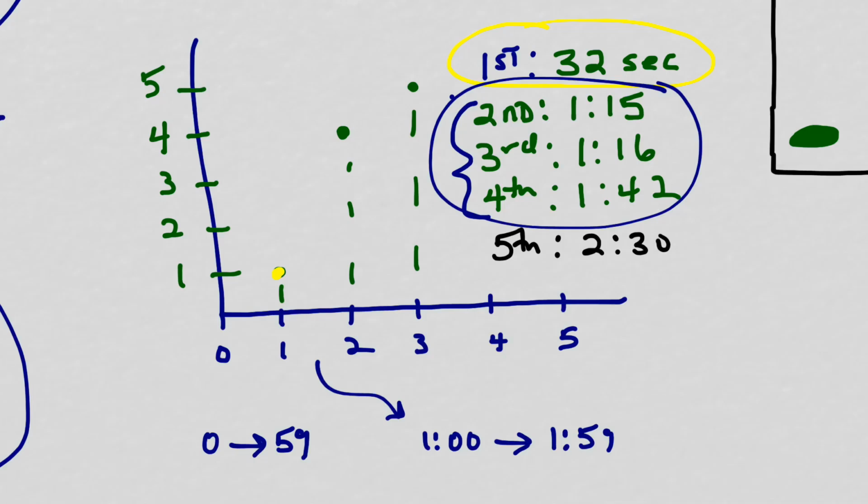Now, as you can see, the 5th disk rose at the 3 minute mark. And what we would do is, in your Excel, you would basically draw a line graph between these dots. And let me erase some of this. We're trying to come up with a median value. Now you have 10 disks, so your chart would grow for 10 disks. And the best way to probably gather this data is using a median value. A median value is the middle numbers.